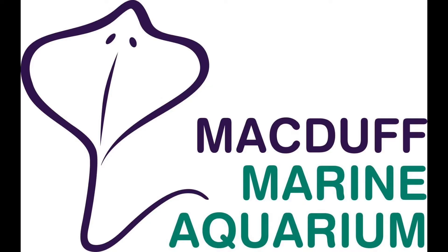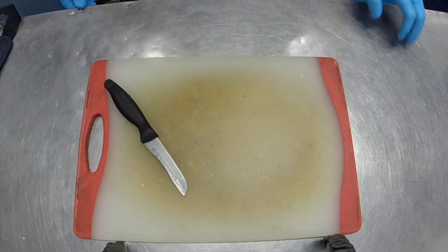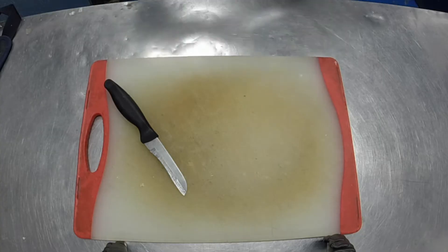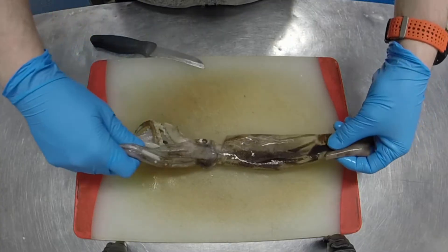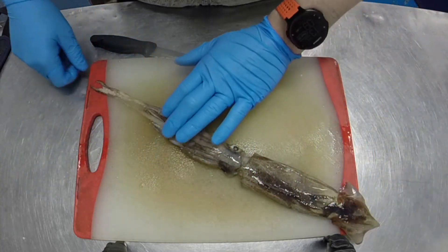Hi everybody, my name is Chris and welcome to McDuff Aquarium's squid dissection. I thought you'd be quite fascinated to see what these animals look like inside. They're kind of fascinating animals, and seeing as we use them every day at the aquarium, I thought it'd be interesting to give you a brief run-through as to what they look like inside and how we use them as a food source.